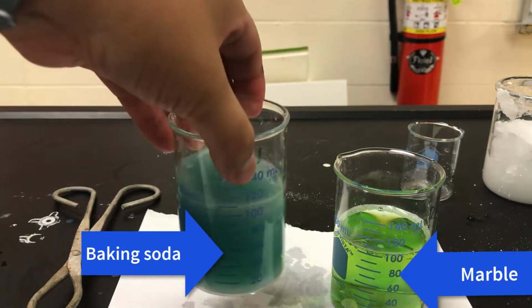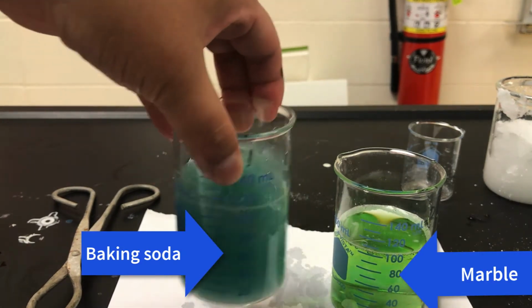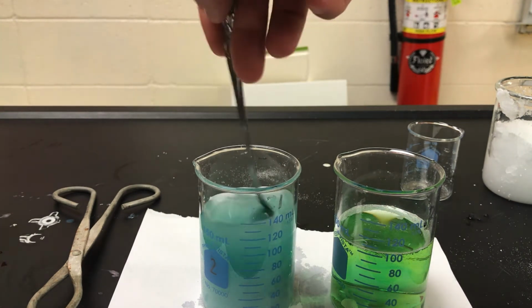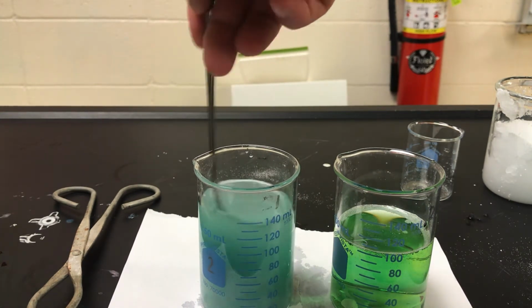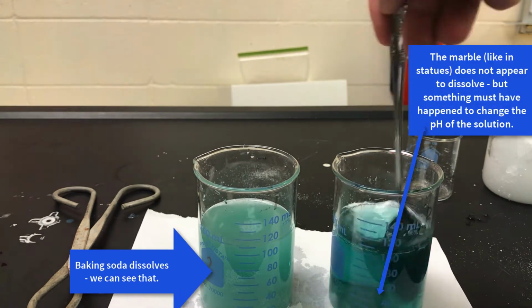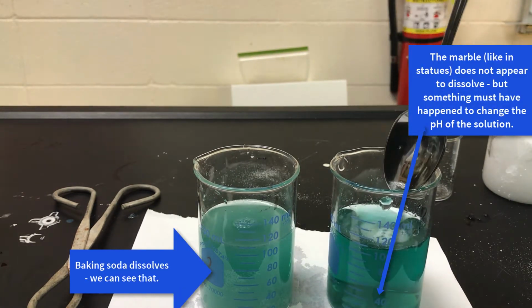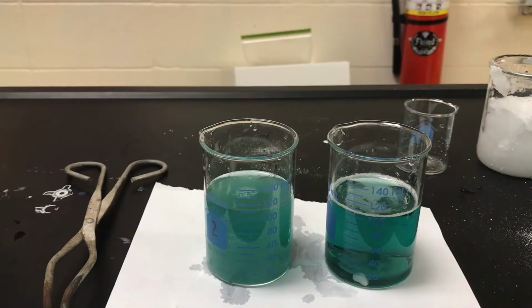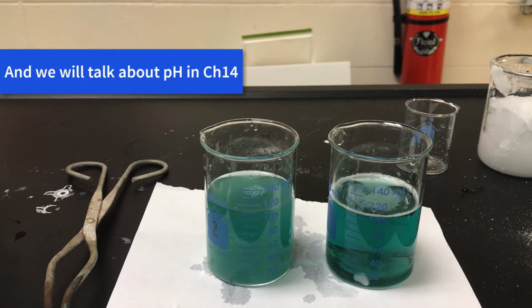All right, so swirl, swirl, swirl, and then stir, stir, stir. And then what's important to take note of, right, is that on the one side, we don't see a lot of powder residue. On the other side, we can still clearly see giant marble chips sitting down there, but they both end up blue. We'll learn to predict solubilities in Chapter 7.